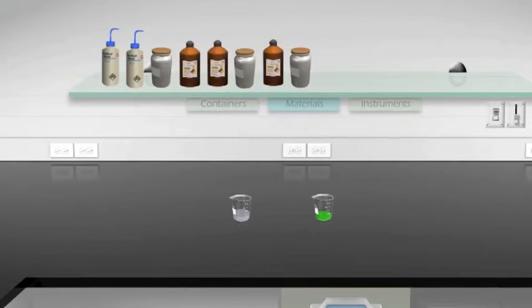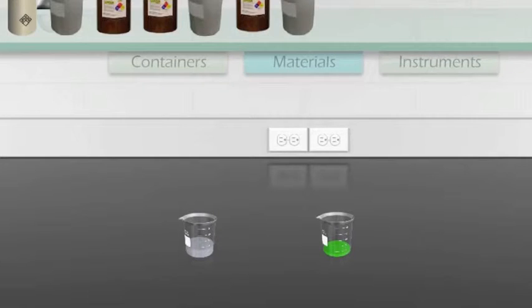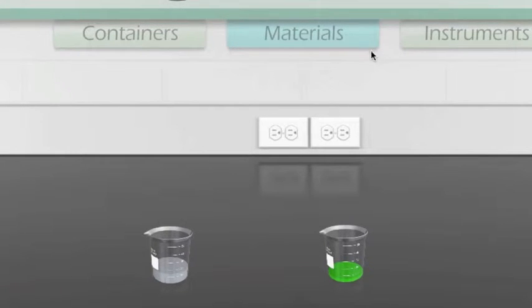We can now zoom in to see these two aqueous solutions that will soon be combined. The clearer sodium hydroxide is in greater amount and thus the solvent. The neon green nickel 2 chloride is in the lesser amount, so it is the solute.